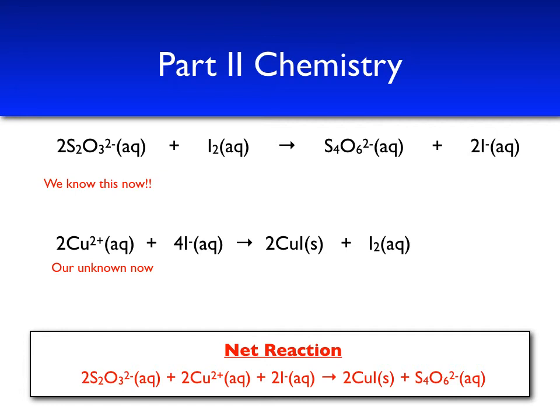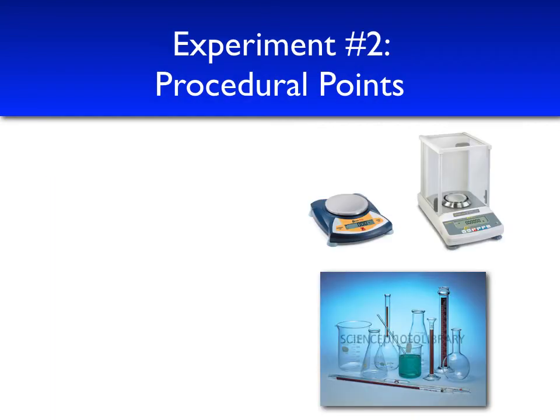Notice that the net reactions are what you want to use when performing your calculations. Let's take a look at some procedural points. Sodium thiosulfate is pretty difficult to dissolve in water. To facilitate this, I ended up using a magnetic stir bar and a stir plate.